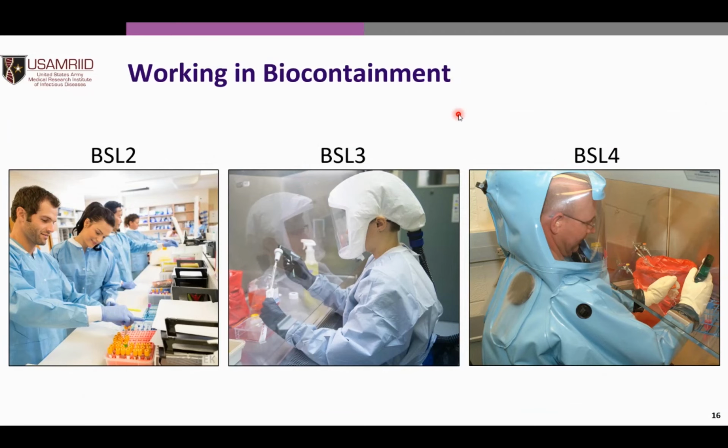And then this fellow all the way to the right is in a BSL-4 suite, so he's got on a positive pressure suit. He's got on a pair of gloves that are attached to his suit, which are actually quite similar to the gloves you wear when you're doing the dishes at home. So if you can imagine trying to wear those kind of gloves when you're doing lab work, it can be very difficult, and it greatly reduces your tactile sensibility. And then he also has on another pair of gloves that he can change in between samples and keep his hands clean.